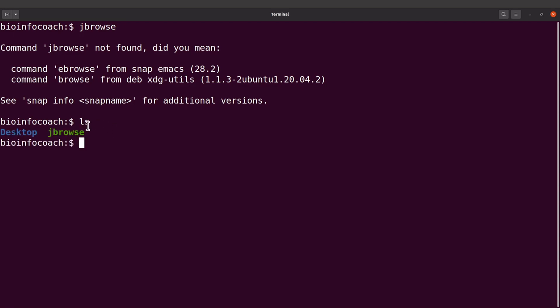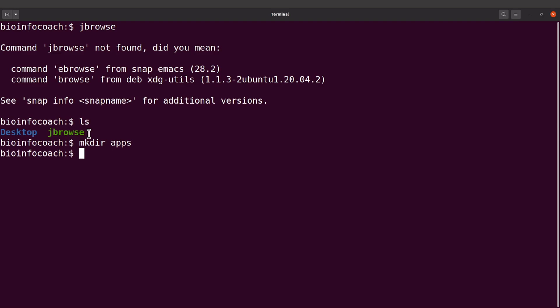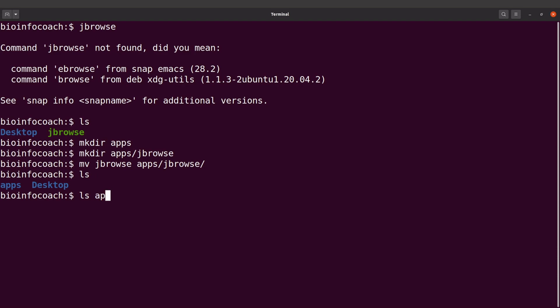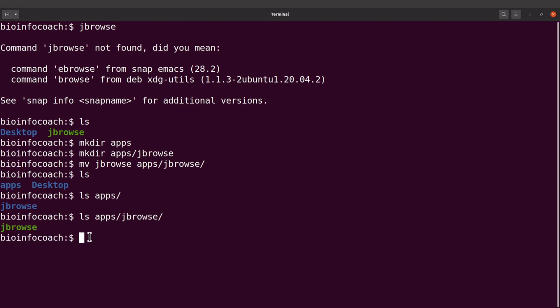Let's do an ls to see what we have. I'm going to create a directory called apps to keep things organized. I'll say mkdir apps/jbrowse and then move the JBrowse executable there using mv jbrowse apps/jbrowse. I always try to organize my tools by putting them in a single installation directory.